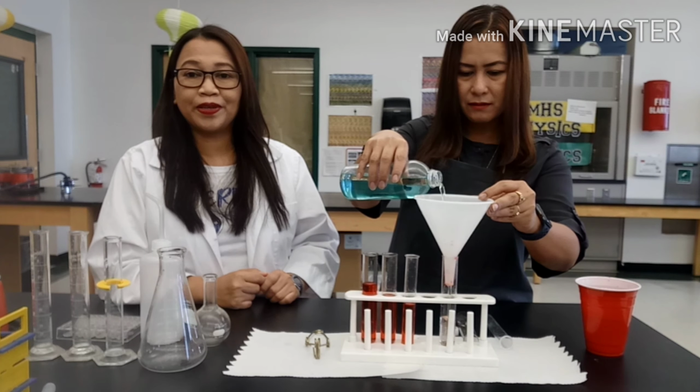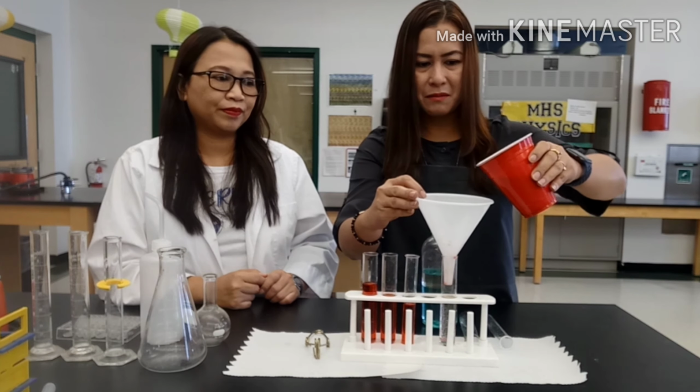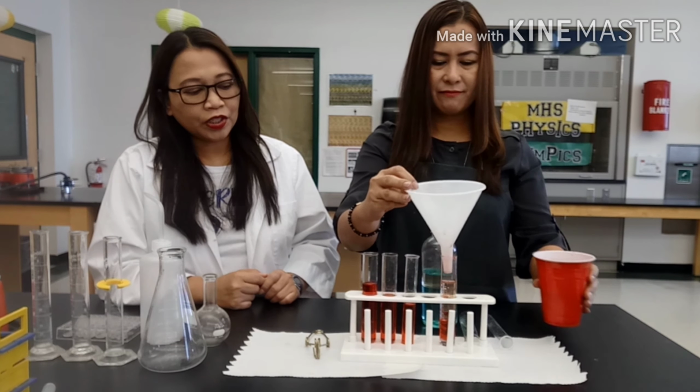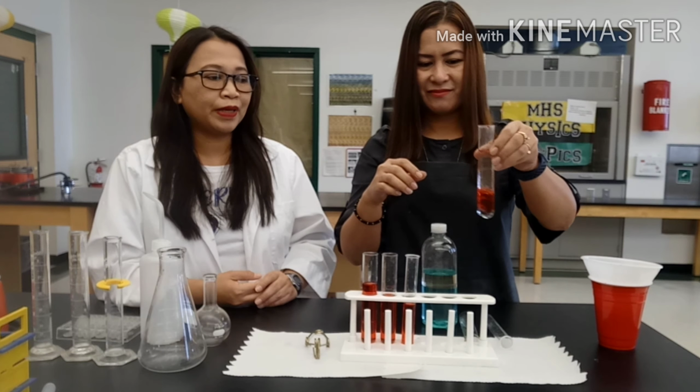This is a safe way to transfer liquid from one container to another, particularly a test tube. So we're going to mix them. As you can see, we have two different liquids in a test tube.